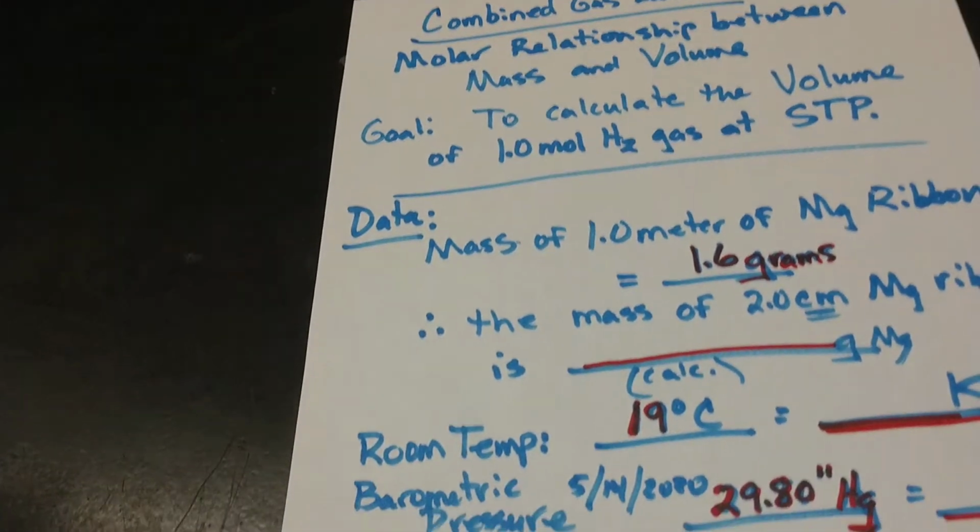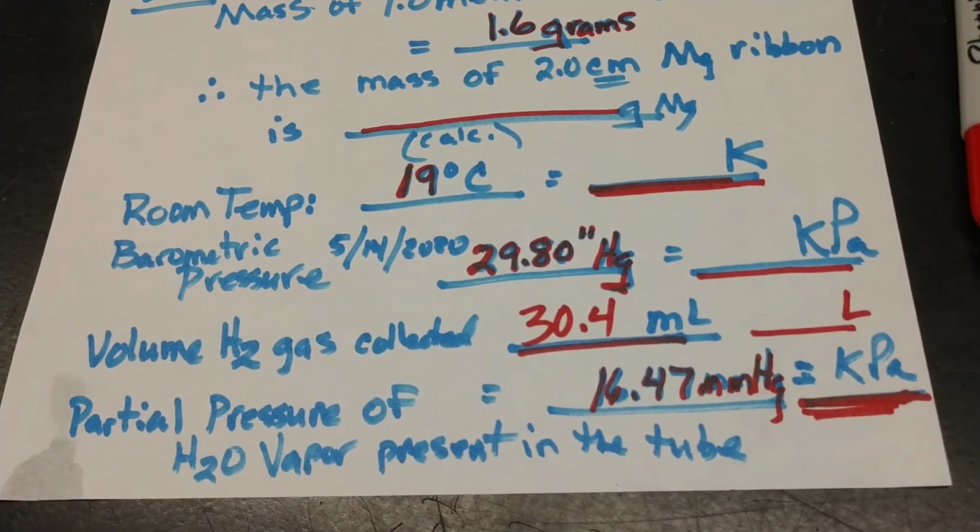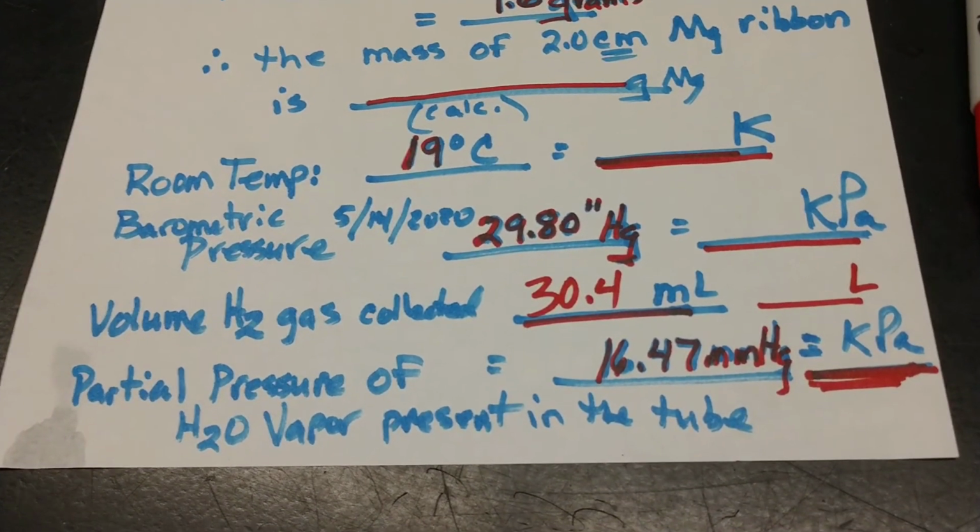Coming back here to finish up, you can see then that we have the data necessary to be able to do the final calculations on your data sheet.